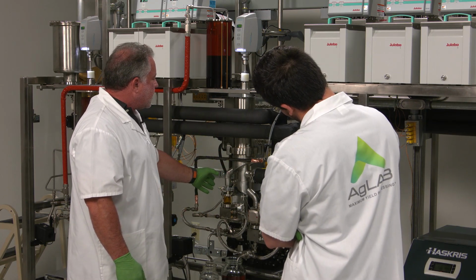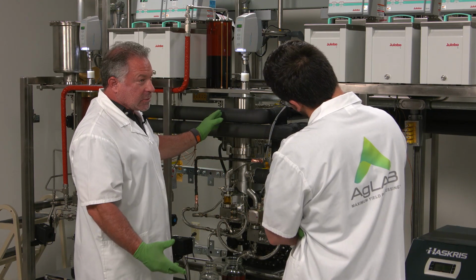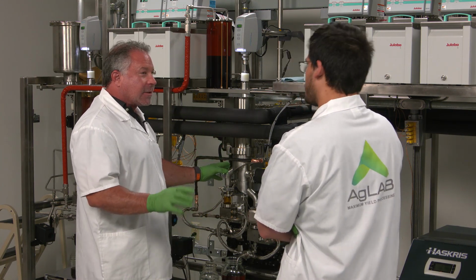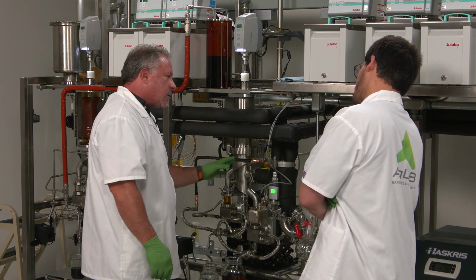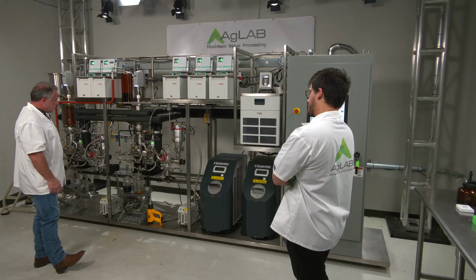If your residue is at a lower temperature than your evaporator, which is generally what you want it to be, you are going to condense some of the things that don't necessarily like to condense at the condenser temperature here, and you can bring some of those heavy molecules back through your residue side. Even though you did evaporate them here, you can condense them here too.